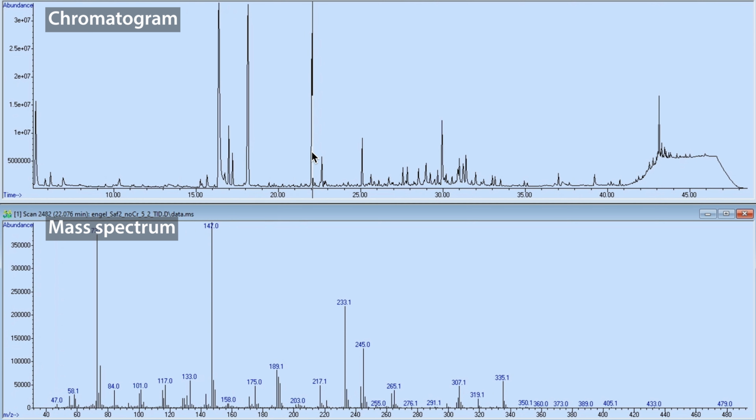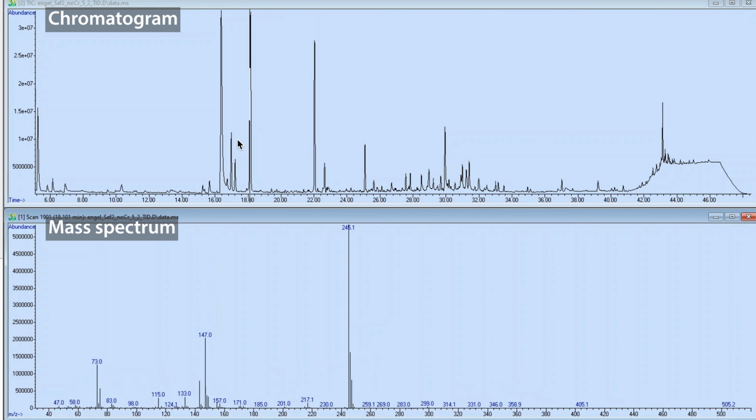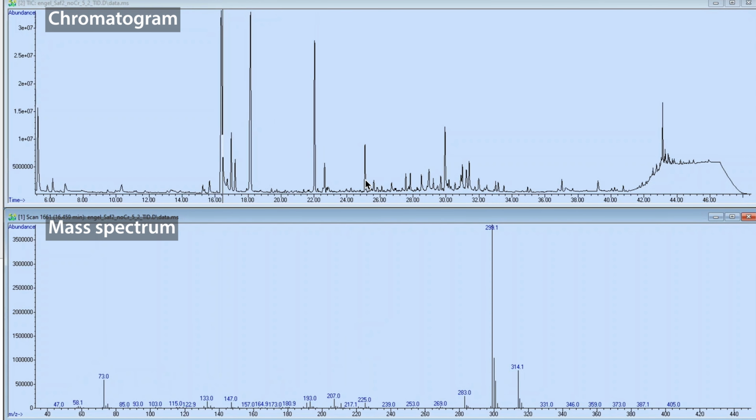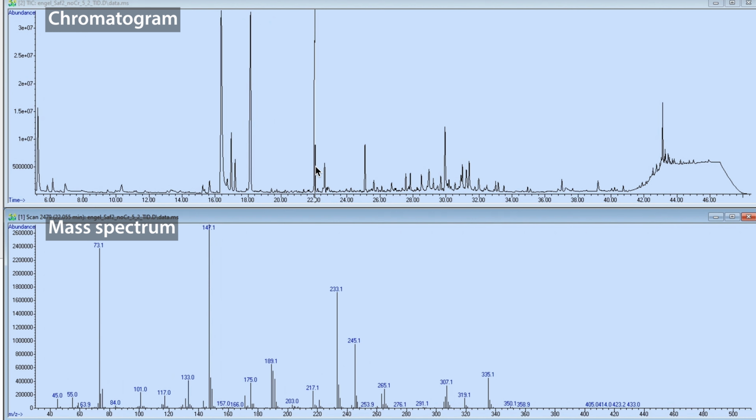And so what are we seeing? If you were to pick one point in time, like one peak, you would see something down here. If you were to choose a different point, you would see a different thing, and a different thing, and a different thing. What this is saying is that at this exact time point, this is the sum of all of this. If I look at this peak, what I'm seeing here is what I would get if I were to add all of these peaks together.